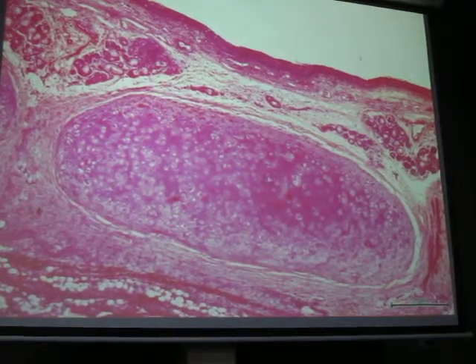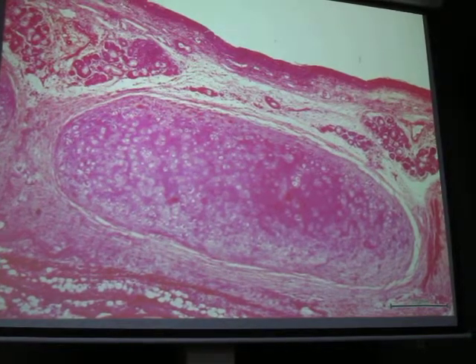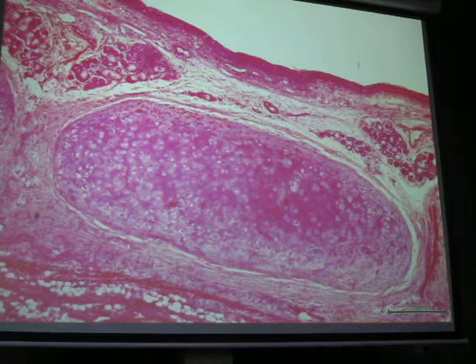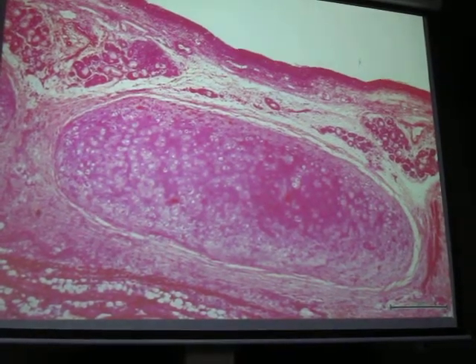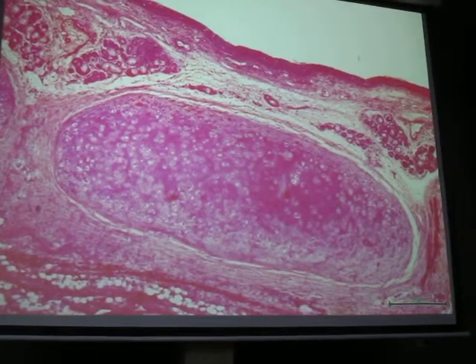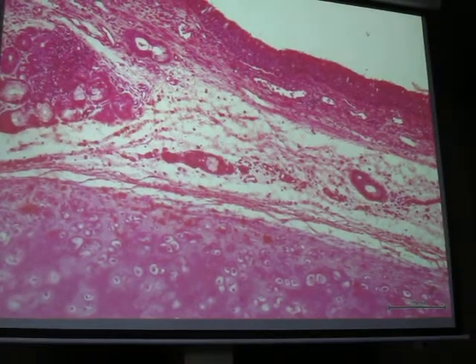Okay, this is the longitudinal section. This is the type of slide in your slide boxes. Okay, does any one of you have the cross section in your slide boxes? No one has a cross section. Okay, so still the longitudinal section of the trachea.